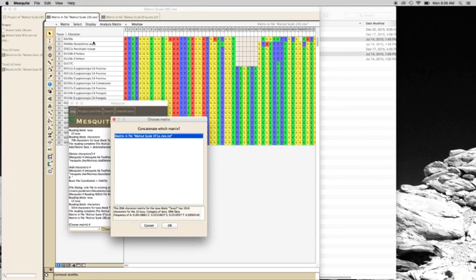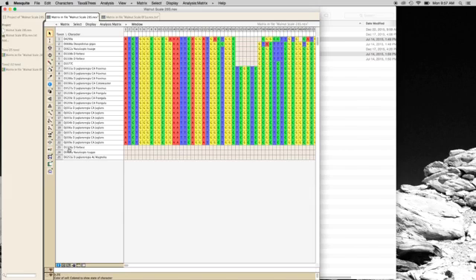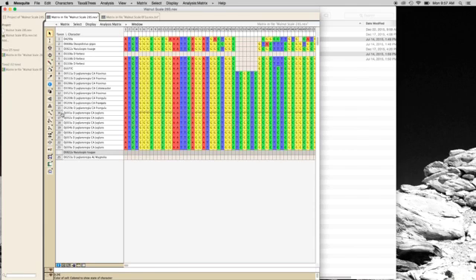And so we're starting from our 28S, that's our more conserved region, and that's the one we have highlighted when we choose this option. Now we're concatenating it with our EF1 alpha matrix, which is open. Okay, great. Now, do you want to add these taxa? Yes, we do, because we actually have individuals here, 1108A, that we have EF1 alpha for, but not 28S. See, for example, and that's fine. We can divide up our data set however we want afterwards.